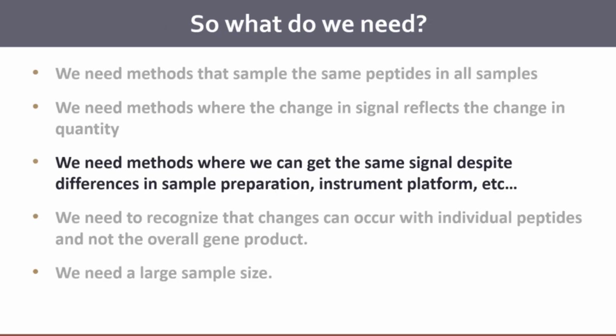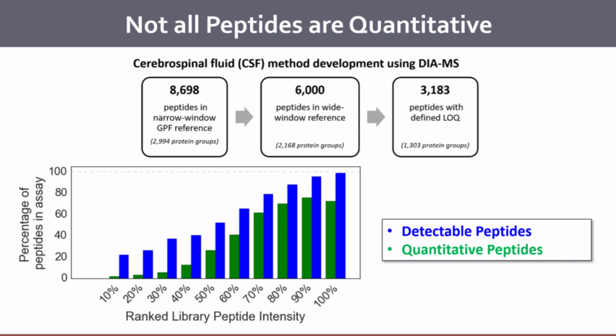Okay, so I will point out that I actually wish that people started to report numbers like this as opposed to these larger numbers. We get to a point where everybody wants to have the biggest list imaginable, but this is the one that often ends up being the most conservative and the most useful. These are the ones that we can measure the most precisely and with the best accuracy, quantitative accuracy.